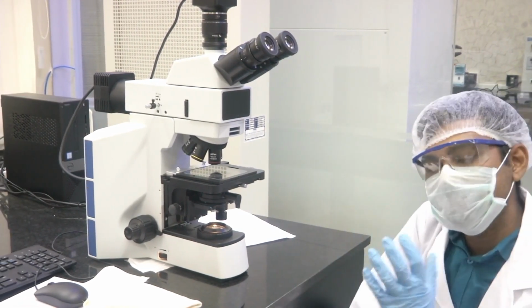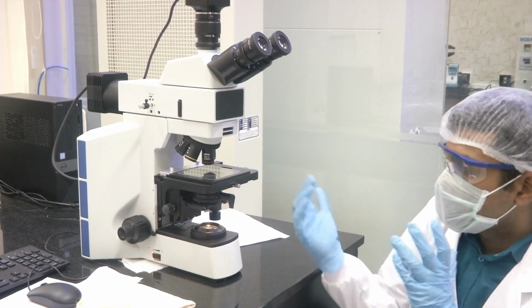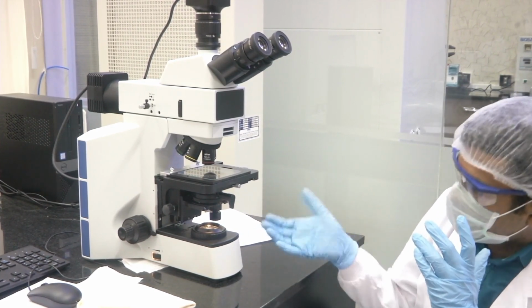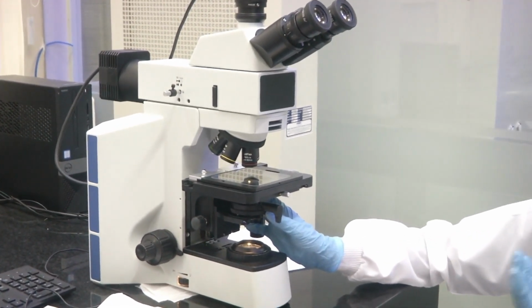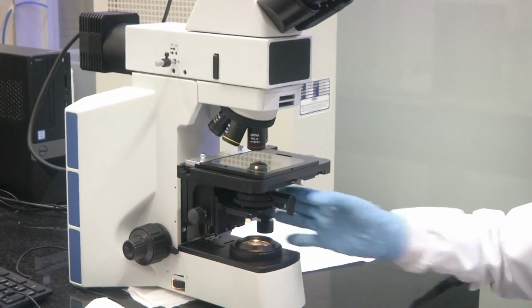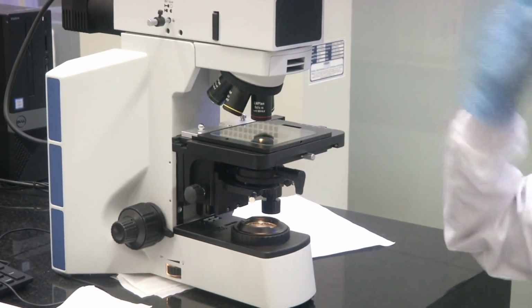That is based on transmission optics. The bottom light will pass through certain filters and aperture adjustment equipment, then through your sample, and will be picked up by your objective and your eyepiece.